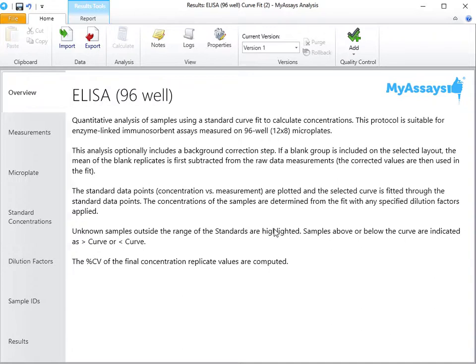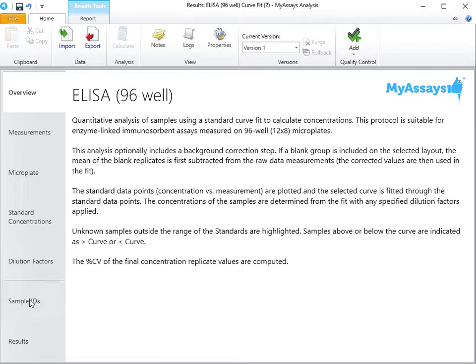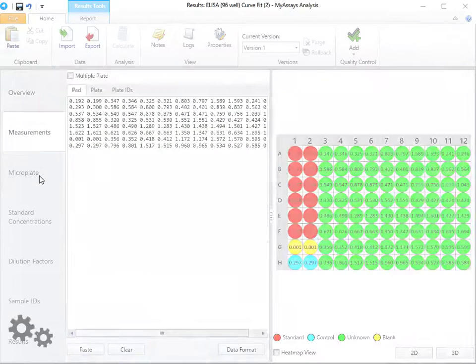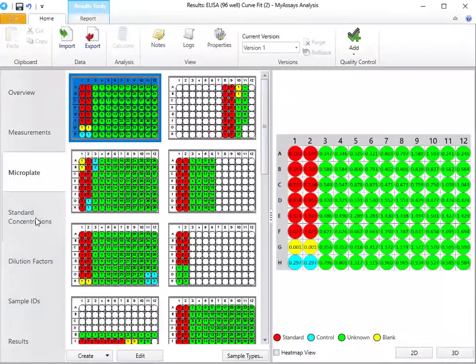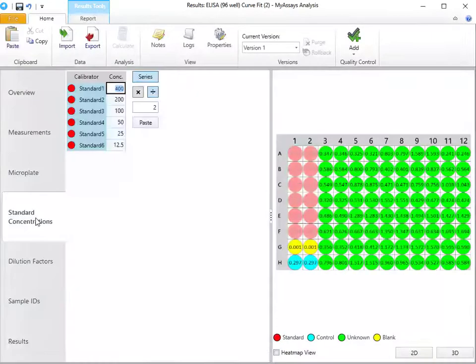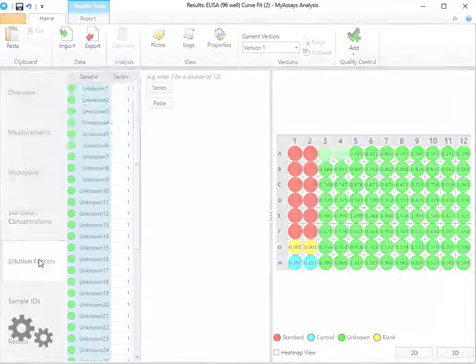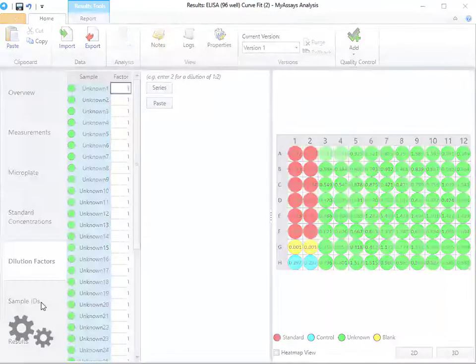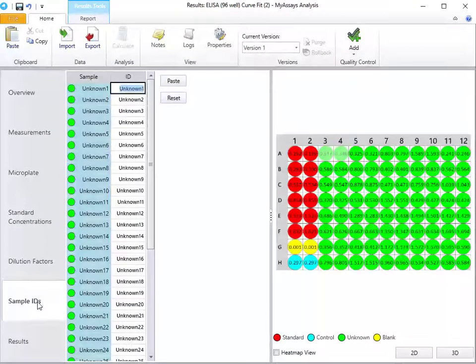I've calculated results using the pre-configured ELISA protocol. You'll notice the tabs along the left-hand side of the screen allow you to configure your assay settings in a similar manner to the online data analysis tools. Measurements, microplate, standard concentrations, dilution factors, and sample IDs.